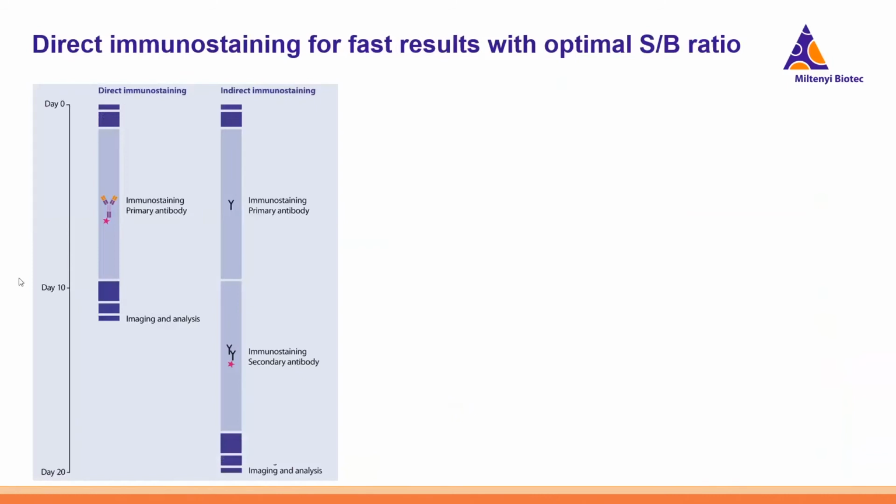There is one thing that I would like to mention as well. When doing direct immunostaining, you of course have the advantage that you are very quick in the protocol. And one thing that these large antibody stainings or these whole workflow protocols have in common, if you use large samples such as a mouse brain, is that the protocol in total is pretty long. And most of the time is accounted for the antibody staining. And what you can see here in this indirect immunostaining, you first label with a primary pure antibody, and then you detect this one with a secondary antibody. And this incubation step is equally long as the primary incubation.